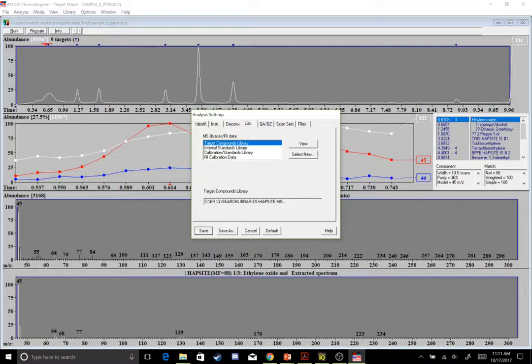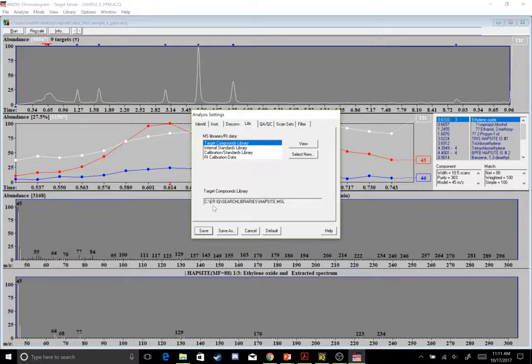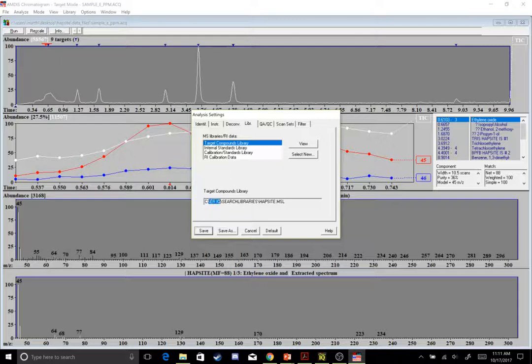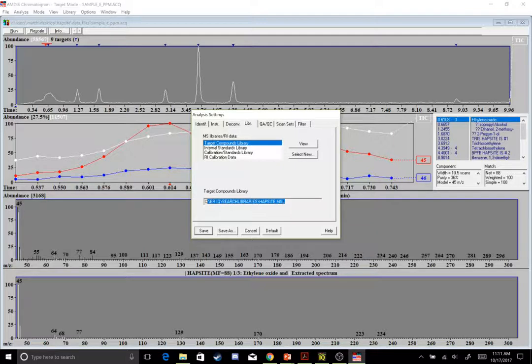There's a couple different ones people use. Some people use the NIST EPA.MSL library. However, I use the HapSite.MSL. This could be set up incorrectly. So if you have this and it looks correct, but it's not opening it up, make sure that it says ERIQ right here. I've had a couple people use this Smart Plus software and it just generates ERIQ anyway, but that folder destination doesn't exist. So they have to manually select it from wherever they placed their search libraries.